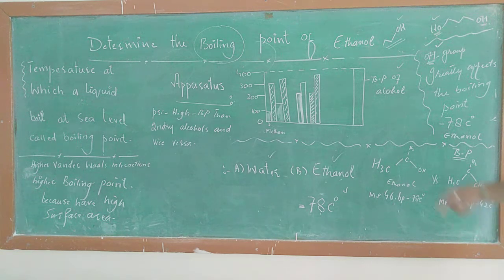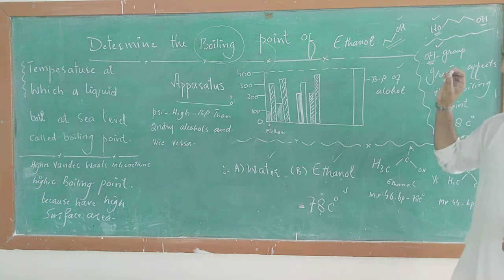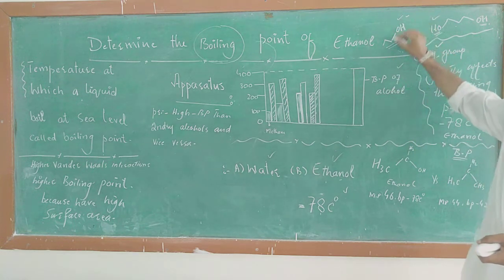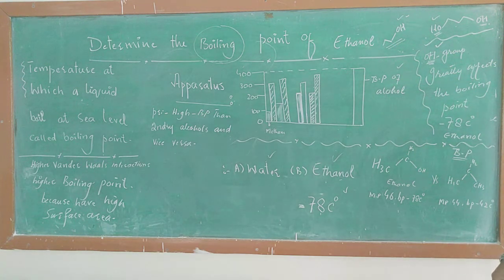We will do this alcohol identification through its boiling point. The alcohol's boiling point will lead us to tell whether the alcohol is a primary alcohol, a secondary alcohol, or a tertiary alcohol.